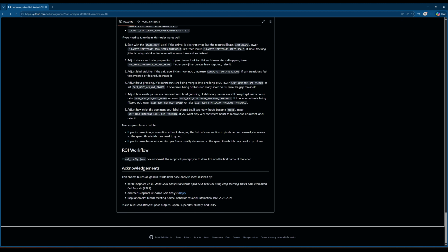I want to acknowledge a few things off the bat. I am carrying over a lot of the code from the previous repo, and I have gained inspiration for this repo from a lot of the talks that I watched and listened to this year as well as last year from APS March meetings, specifically the animal behavior and social interaction talks.